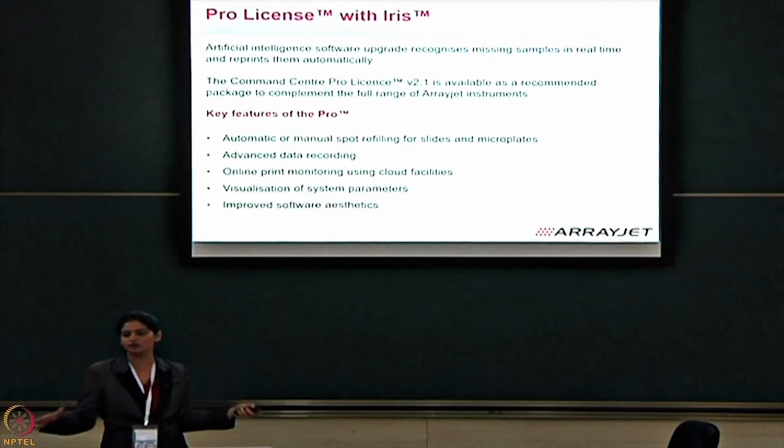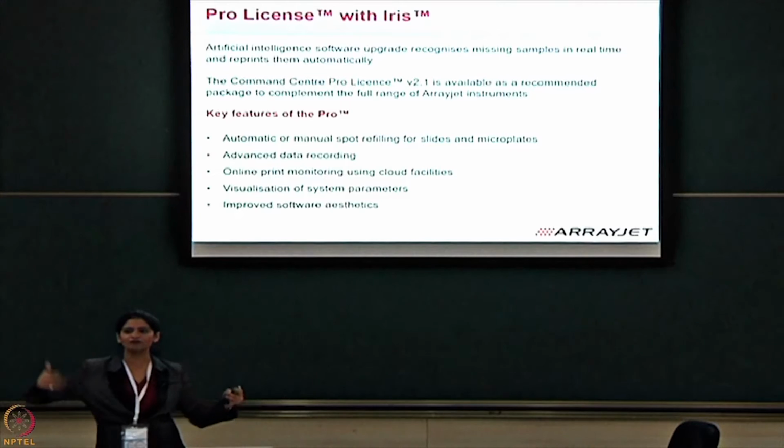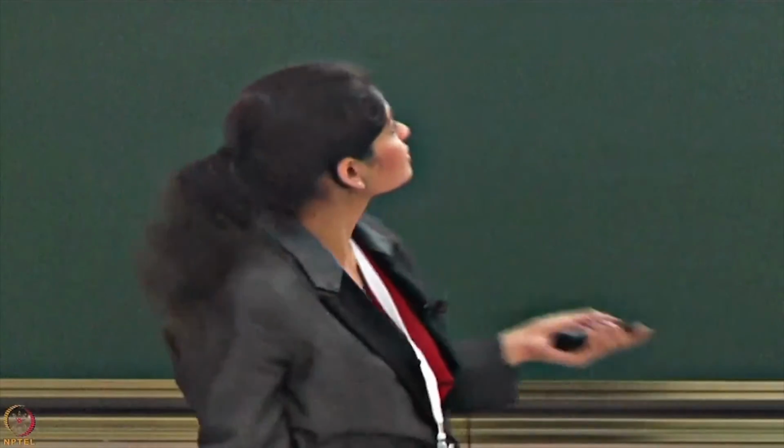And if it's a long assay, if it's going to take maybe 4 hours and you have other things to do, you can press start. You can go back, come back after 4 hours, and you'll have a few files waiting for you in your cloud. Right, this is my assay, this is how successful it was, how many missing features there were, whether it was able to detect all my antibodies, what my data is. It'll give you a couple of reports. You just take those reports and then you can post-process them automatically with your secondary antibody or whichever method, RPPA, whichever method you're using to characterize.